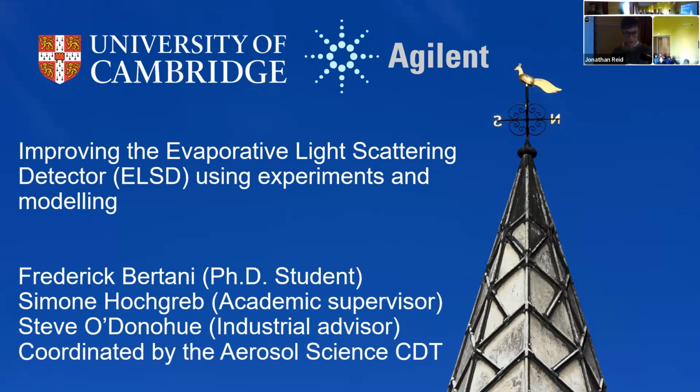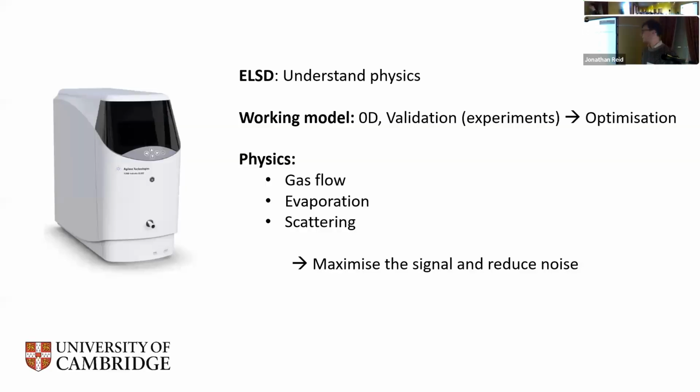So my project is an industry-led project. I'm working together with this company, Agilent, who have this device called an ELSD. It is a chemical analytical instrument used in industry to detect compounds. It's used in the pharmaceutical industry and in the food industry.